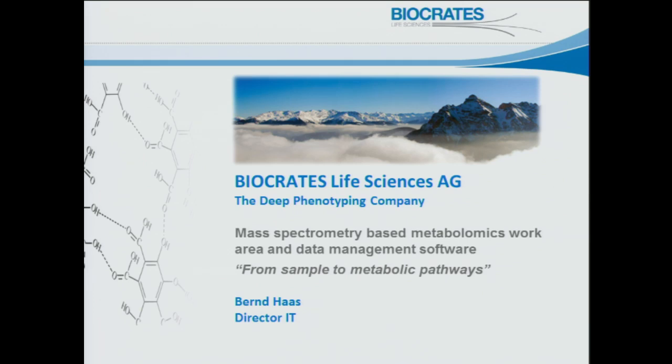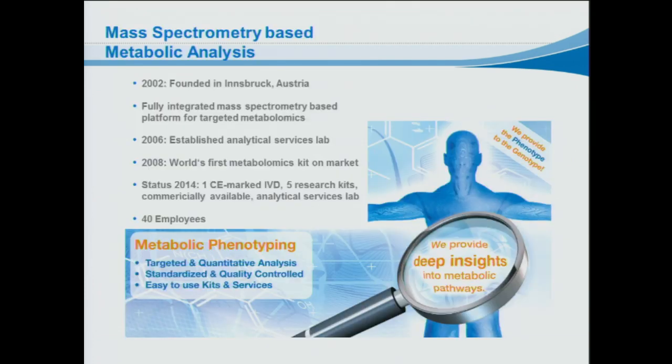Thank you for your kind introduction. Well, from my background, I'm a computer scientist with focus on software engineering, and I spend a lot of time automating all the workflow. You have to know that we are focusing on targeted metabolomics, and we have realized a software with which the workflow is supported from the sample registration to the mapping of the concentrations to the metabolic pathways.